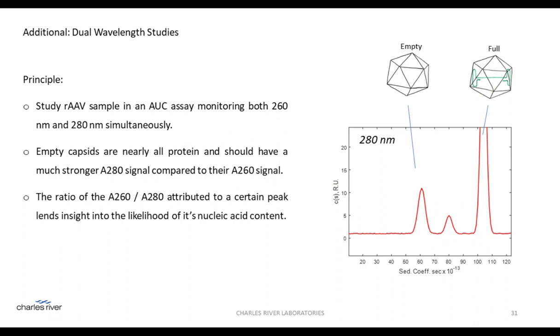And so conventional empty full characterization is usually done at a low UV wavelength like 230 nanometers, where absorptivity is very strong, and where there is likely to be relative parity in terms of the absorbance strength of empty and full capsids.